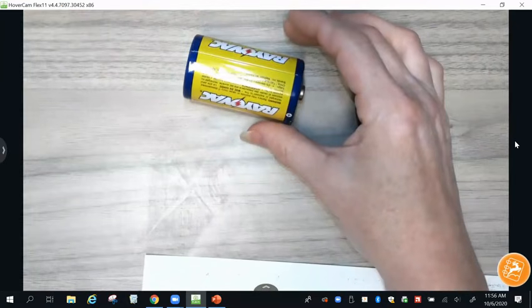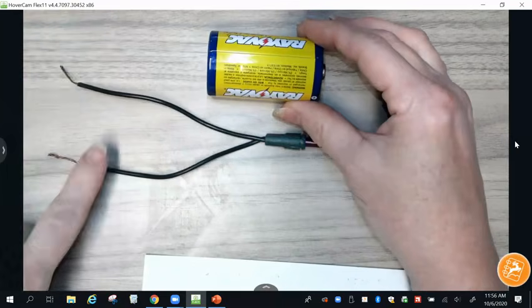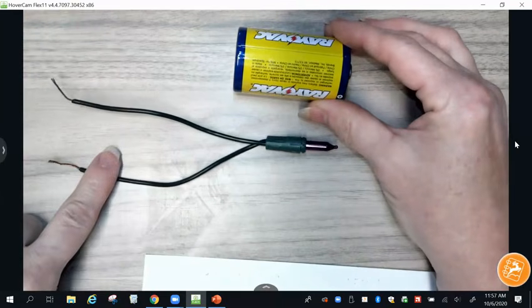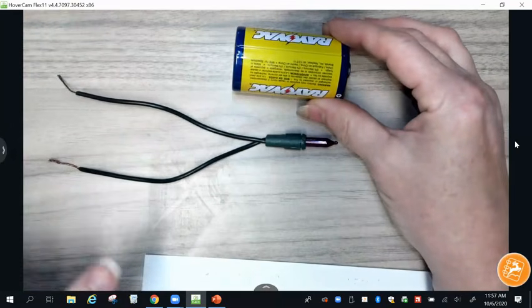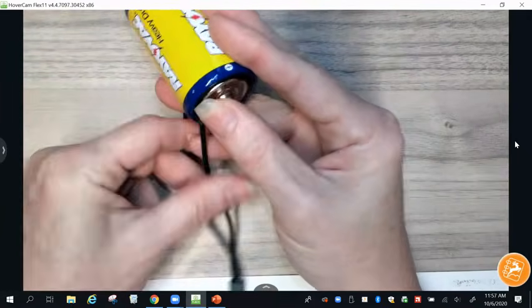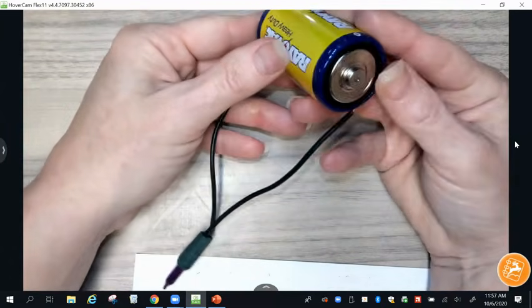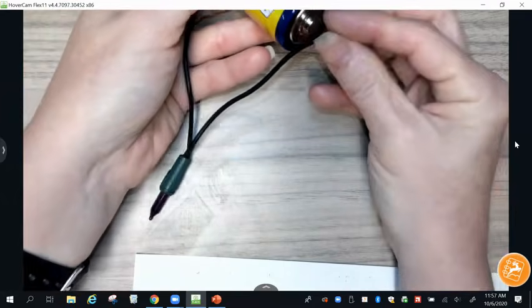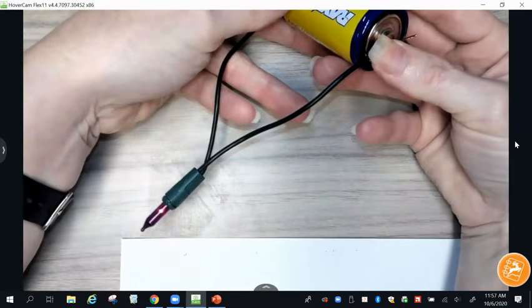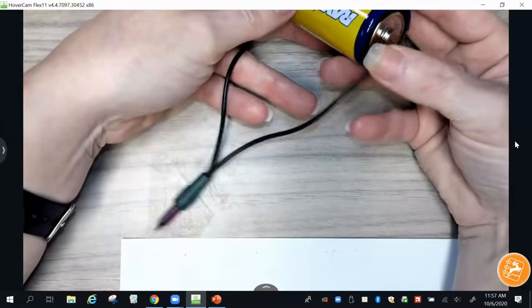And I'm also going to be using a battery and a Christmas light to check for conductivity. I used it in my other classes. So watch, I'll test it. Okay. It did. Look right there. Can you see the light? It's hard to tell, but like that.